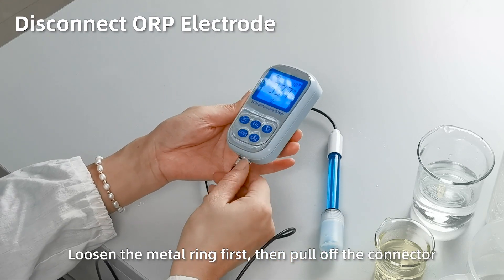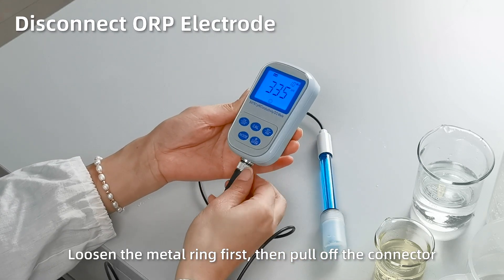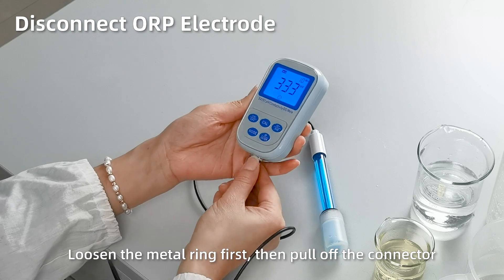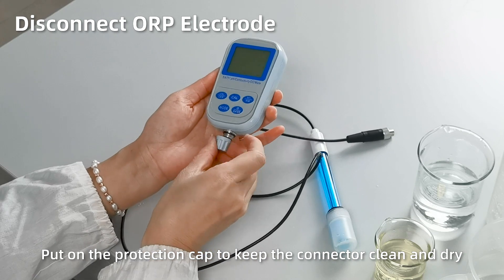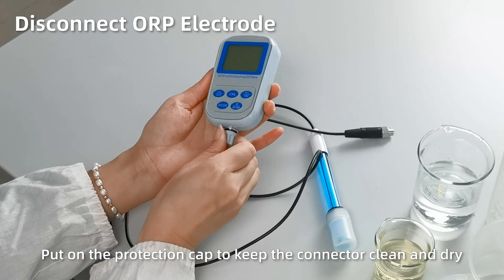Disconnect the ORP electrode: loosen the metal ring first, then pull off the electrode. Short press Off to power off. Close the protection cap to keep the connector clean and dry.